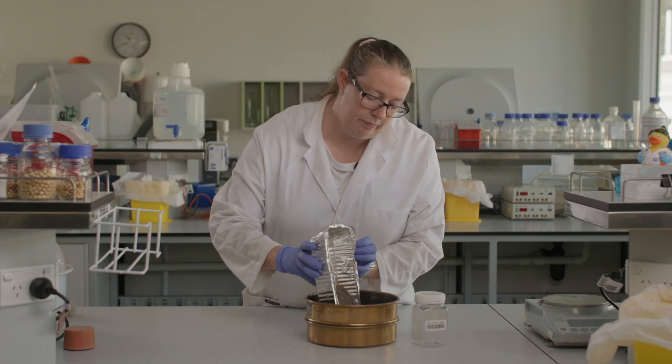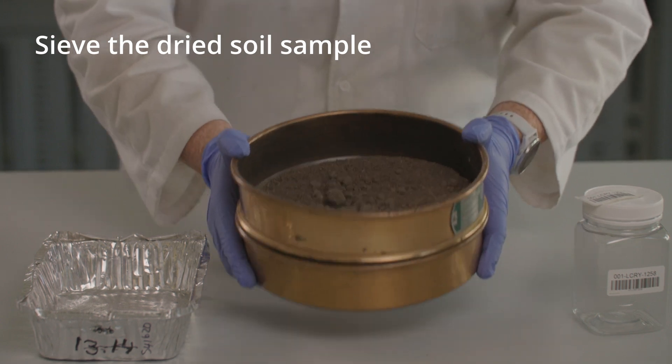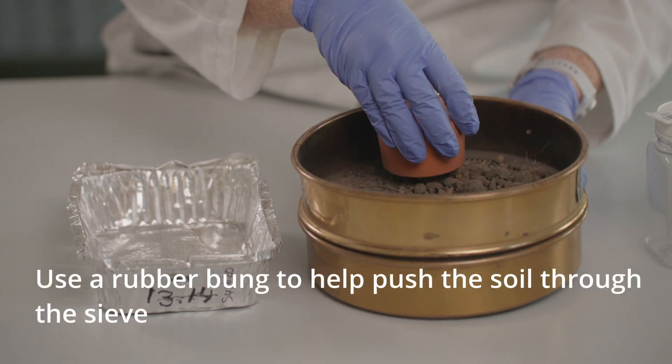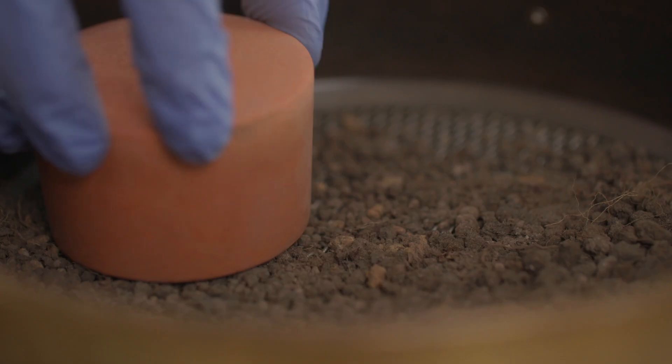Once dry, sieve the entire sample through a standard 2mm sieve. Be careful not to force any charcoal, bark or brittle rock through the sieve. Use a rubber stopper to carefully break up soil aggregates and push soil through the sieve.